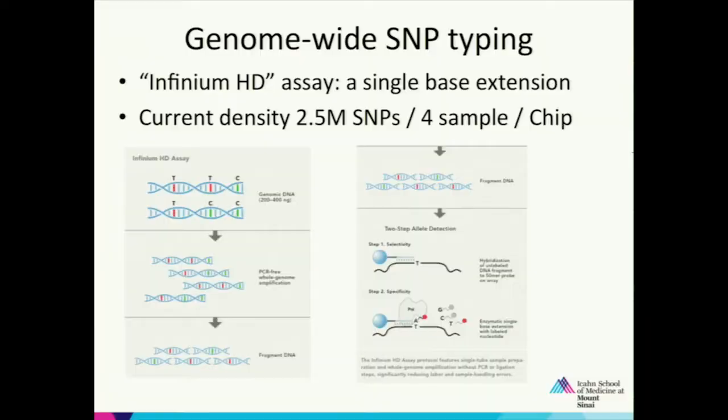And now, how do you do genotyping, right? So this is an expression again. How do you do genotyping here? Same thing. Instead of RNA, you take DNA, right? So small pieces of DNA. How do you do that? Initially, you take the genomic DNA, break it into small pieces, or you just amplify that genomic DNA, because if you take a small amount of DNA, 1 or 2 micrograms or less than 1 microgram, it is too small an amount. Amplify that, break it into small pieces, and hybridize those pieces here, right?